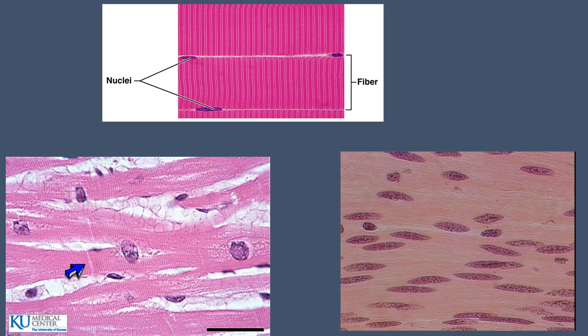So this picture shows the three different types of muscles. So how would you distinguish between them? Personally, I find one of the easiest ways is to look for the striations. Look for the striping pattern. How you can see those stripes there. If it is striped, that means it is skeletal or cardiac. Over in this diagram, there are no striations to it, so it has to be smooth muscle. So this indeed over here is the smooth muscle.